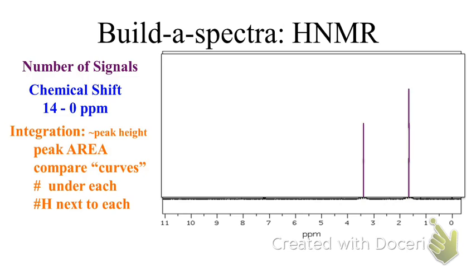So what we can end up doing is comparing those curves to figure out the area underneath them. In this case, because I drew them as straight lines, and because I did it poorly, we can see that there's an approximate joint in each of these. Oh, my pen's failing. Okay. What area would you say is under this signal? How many units are there? 2. How many units are in this one? 3.